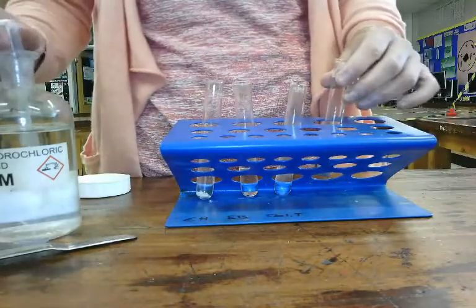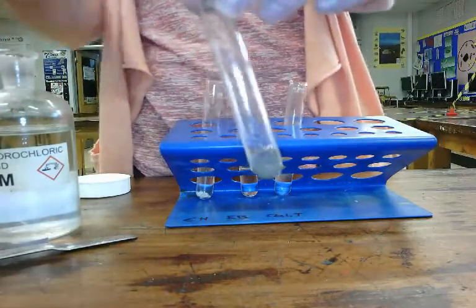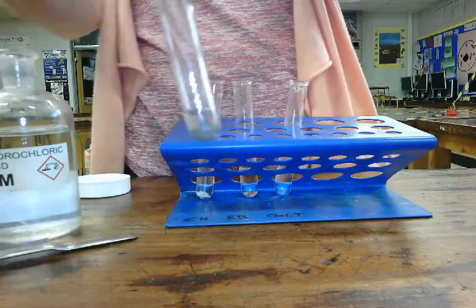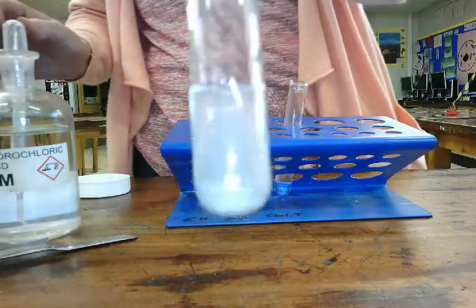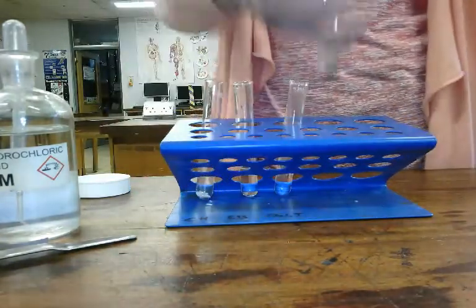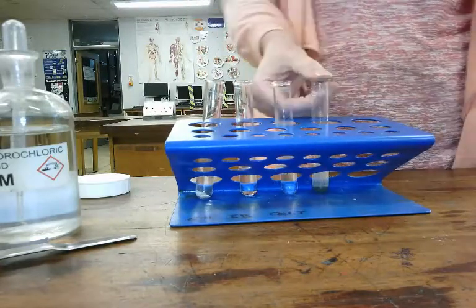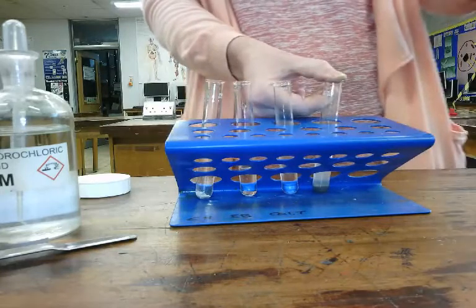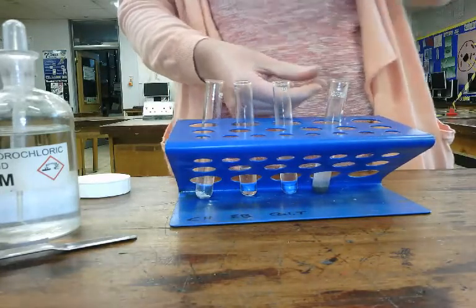The last one is iron filings. We've just used smaller bits of iron just to show you that there is a reaction, because you can see that fizzing again. Thumb over the top, back into the test tube rack, bring the splint over, no pop.